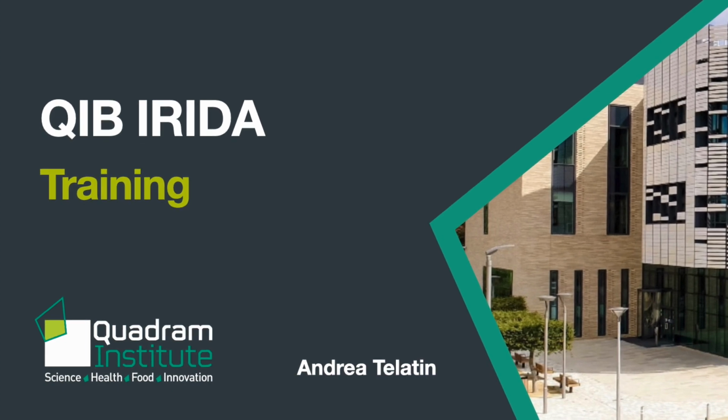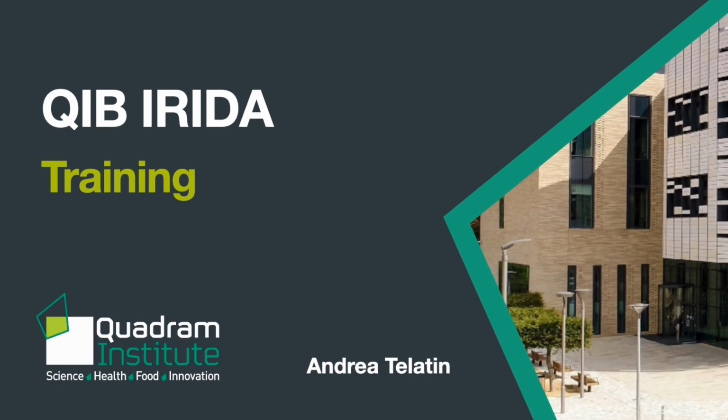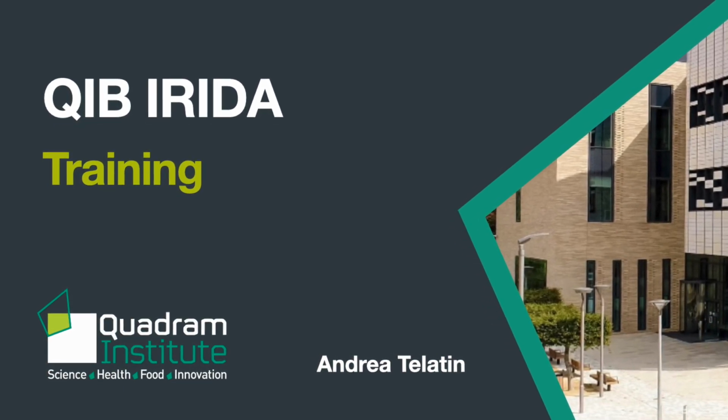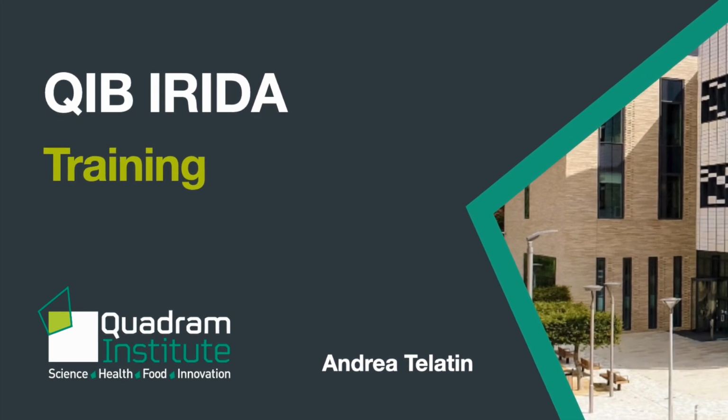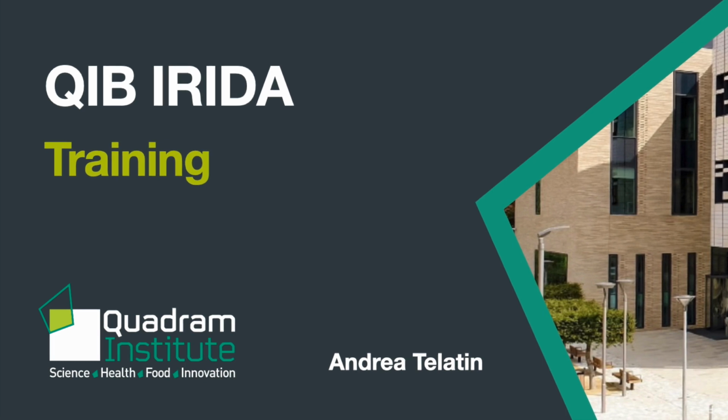Welcome to today's video tutorial on IRIDA, a powerful web-based application for managing sequencing runs and their associated metadata. In this tutorial, we'll guide you through the essential features of IRIDA, from logging in and viewing projects to adding metadata, creating new projects, and downloading reads.